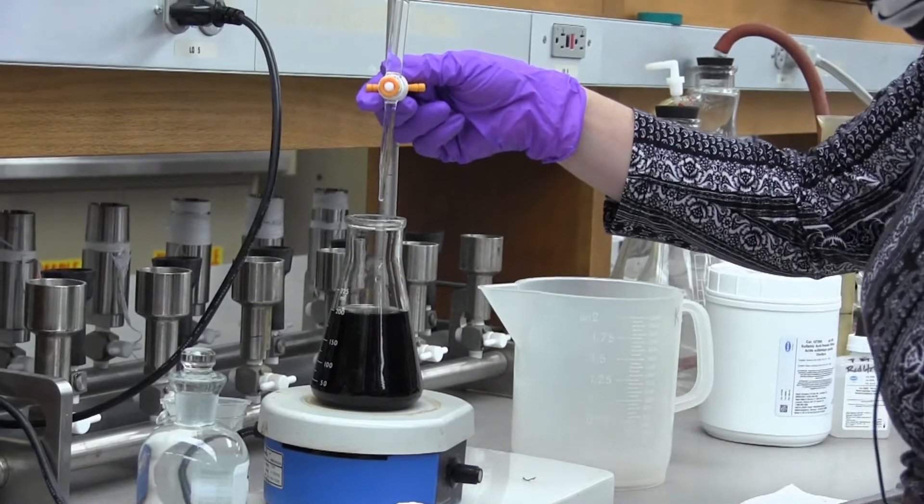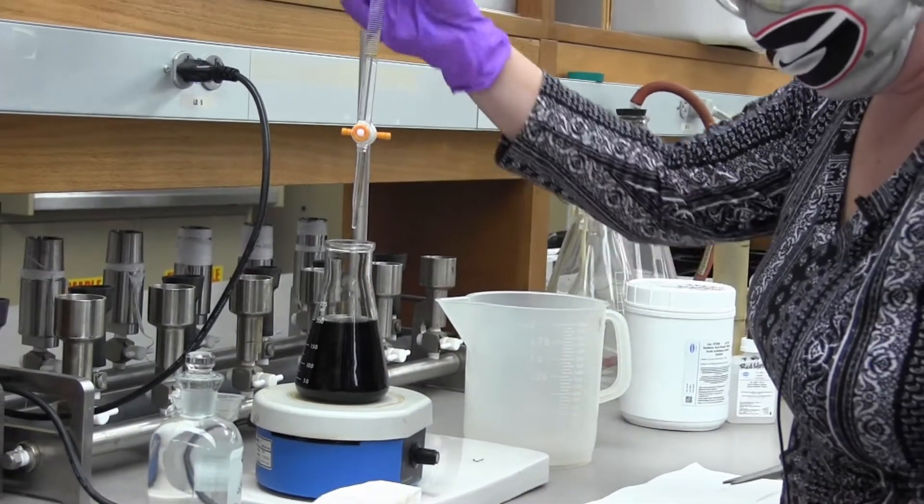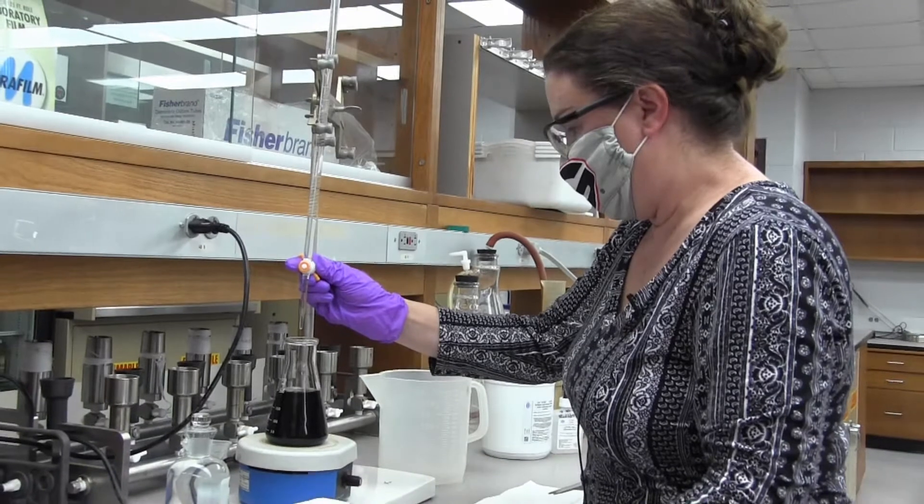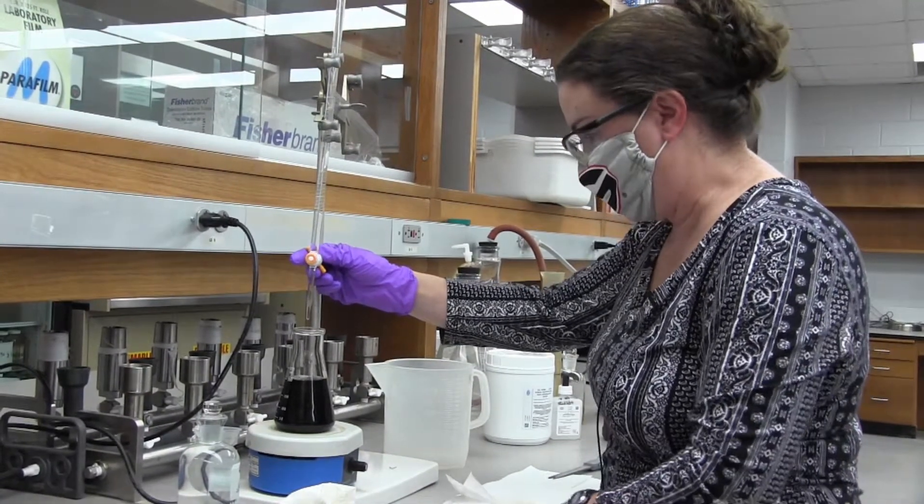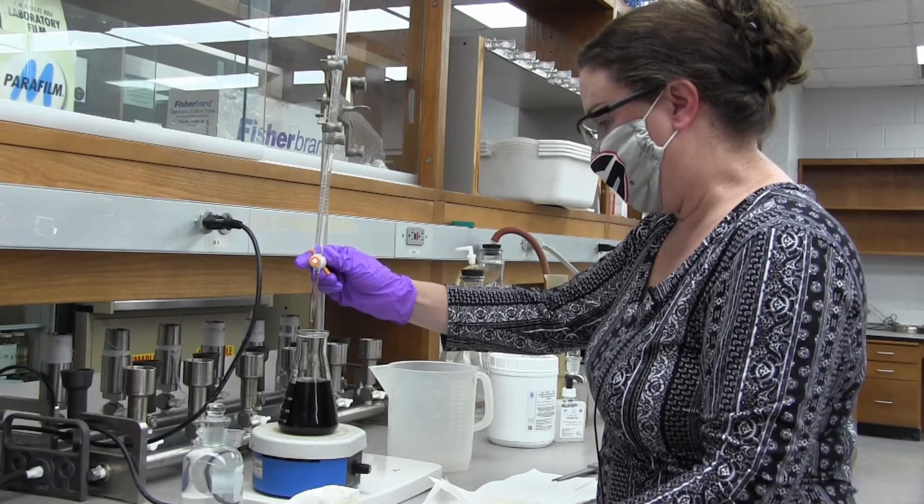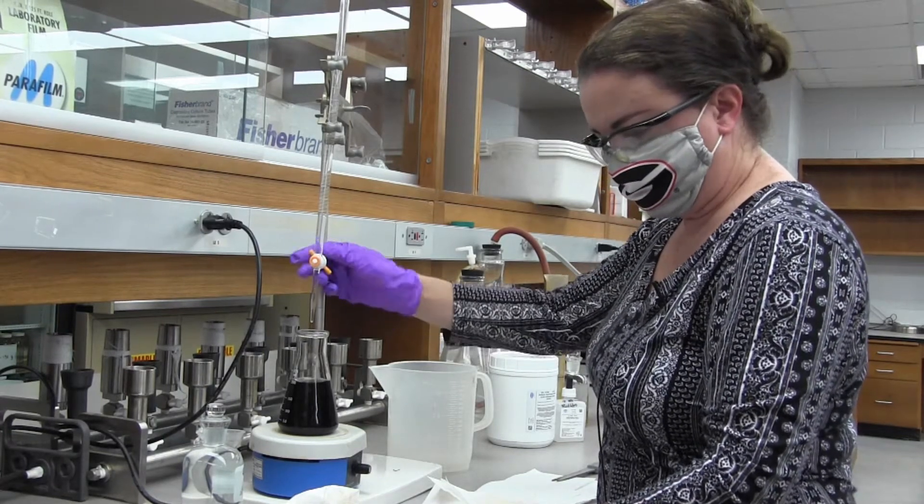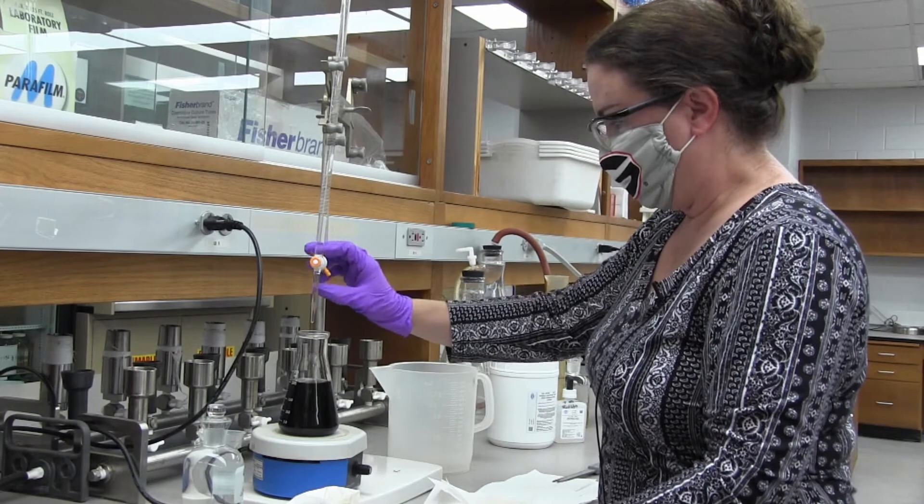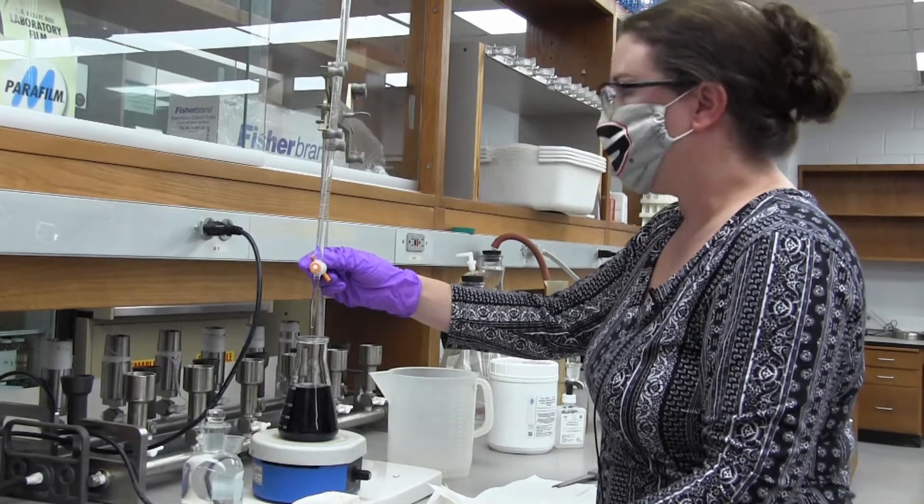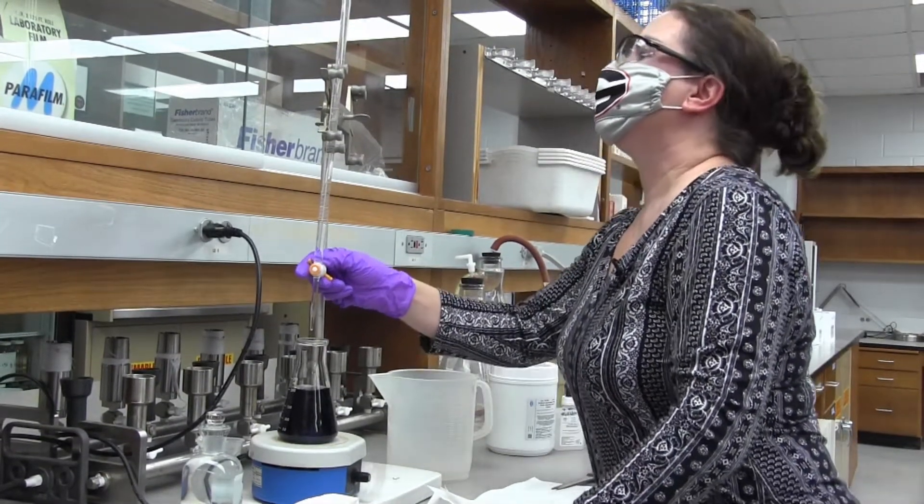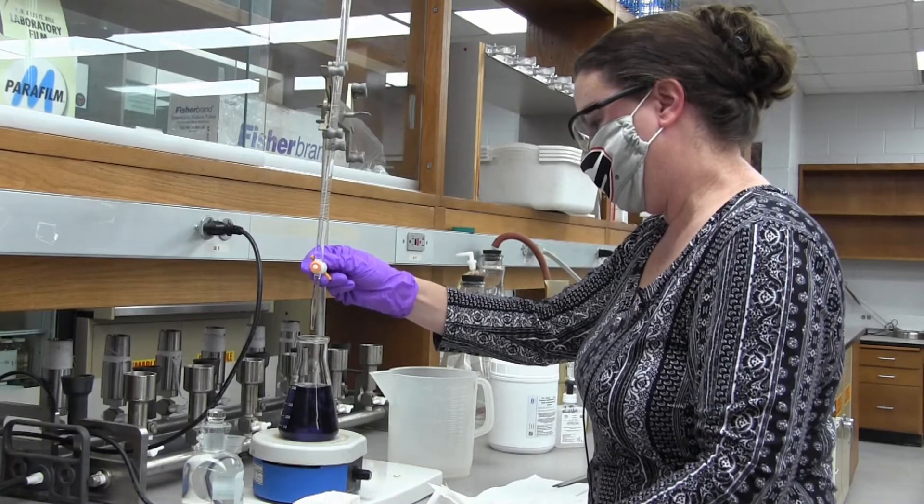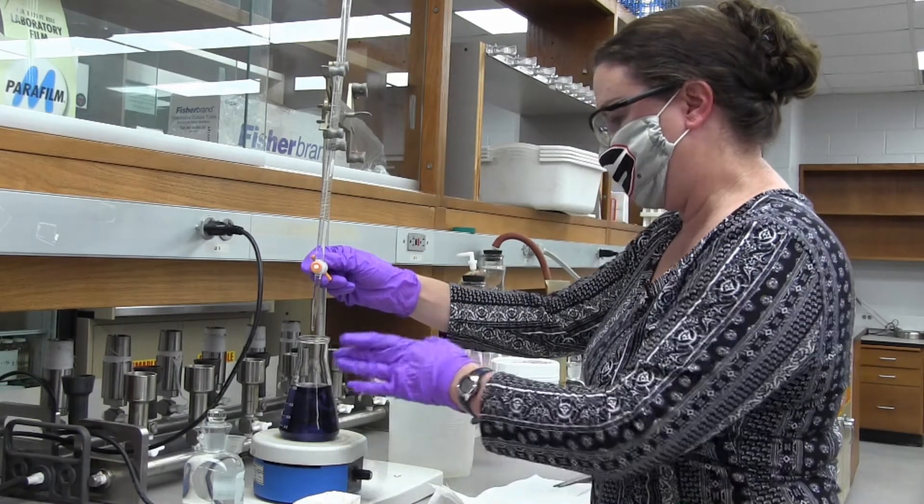Now we're going to continue titrating until the solution changes from dark blue to colorless. You don't have to titrate slowly at first, but when it starts getting lighter you want to slow down the titration or you'll miss your end point. Right now I'm about seven mils. I'm just getting it to a drop now.